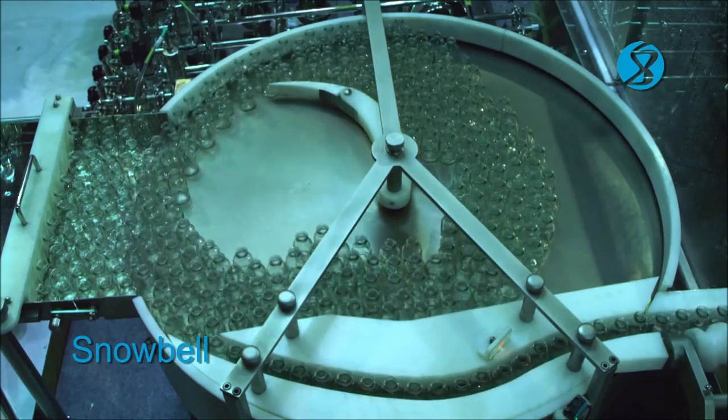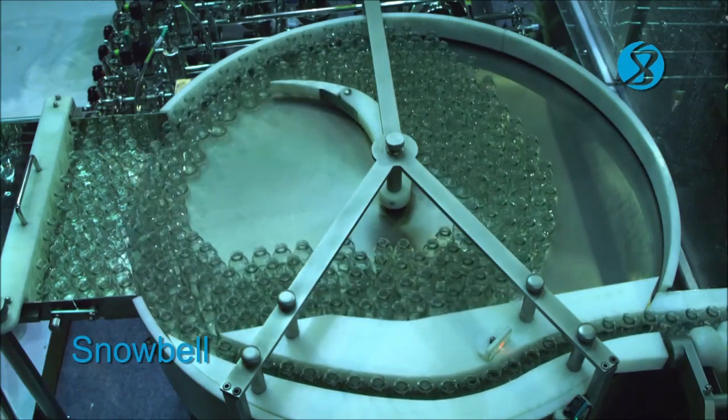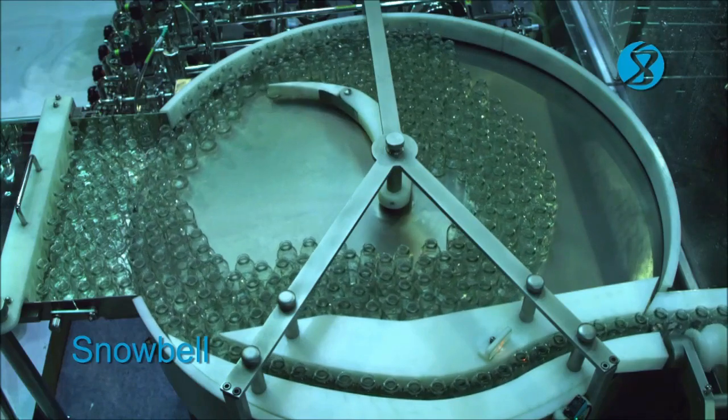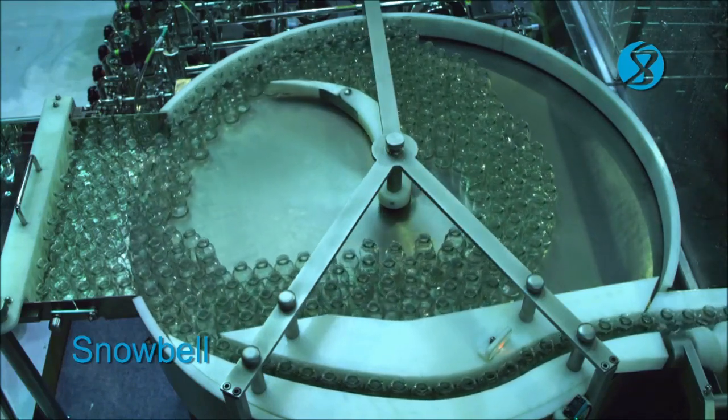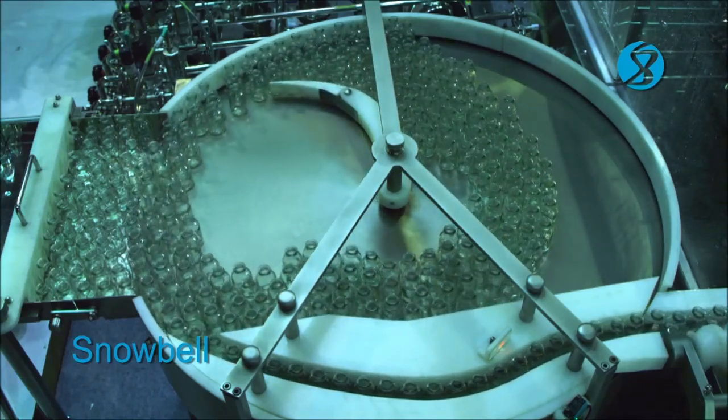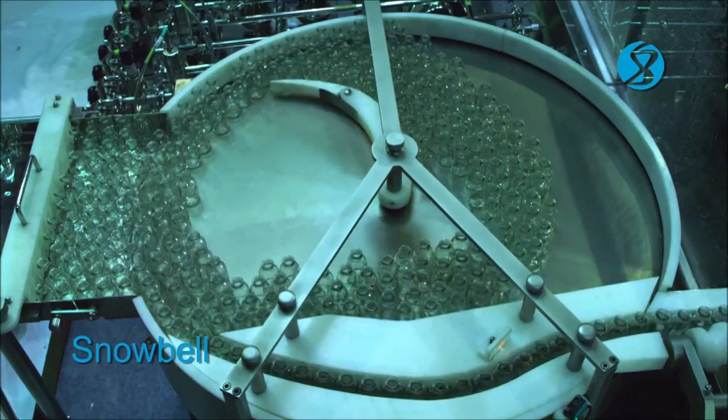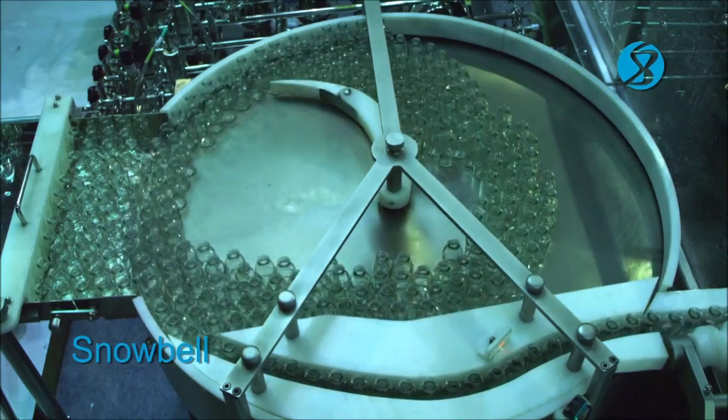Vials are fed to an in-feed conveyor from the decartening room through a vial transfer system. The in-feed conveyor transfers the vials to a turntable. The in-feed turntable unscrambles the vials.